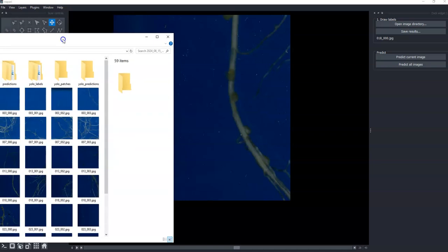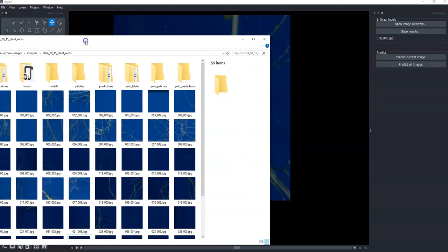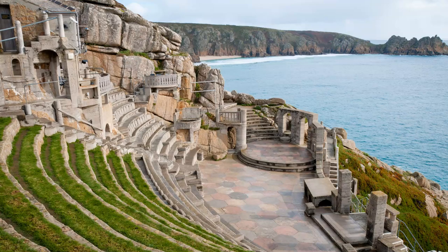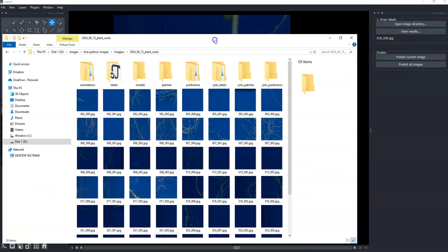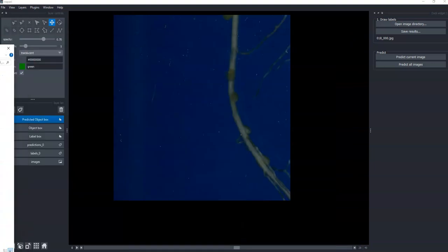layers. And really, the information in this folder isn't Napari specific. If you've ever heard of MVC, Model View Controller, Napari is like your view, you're viewing your data, but then the model can be independent of Napari. So actually, this data here, you could hook up some other GUI to it.